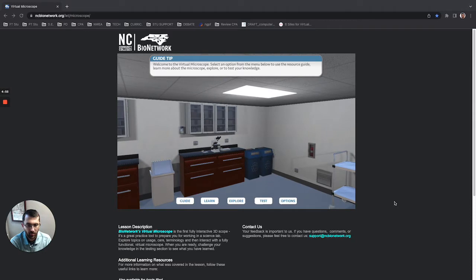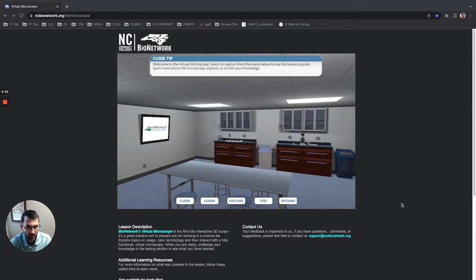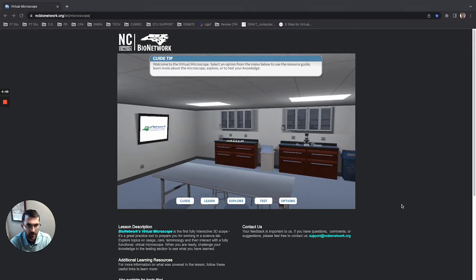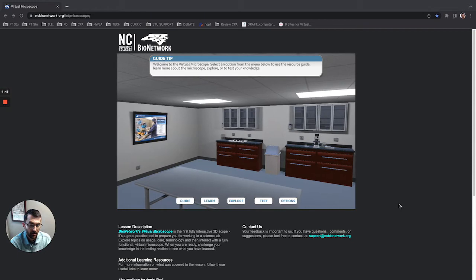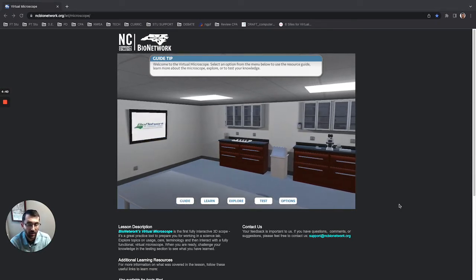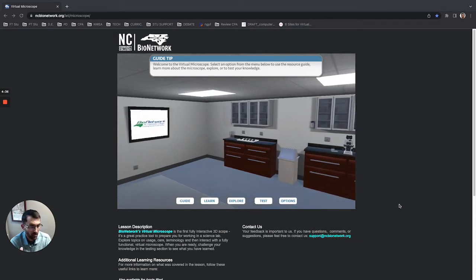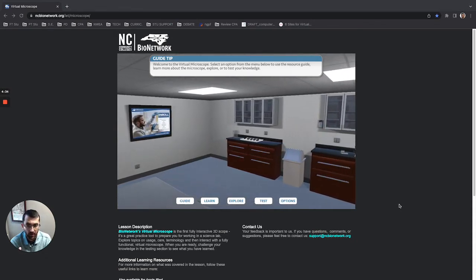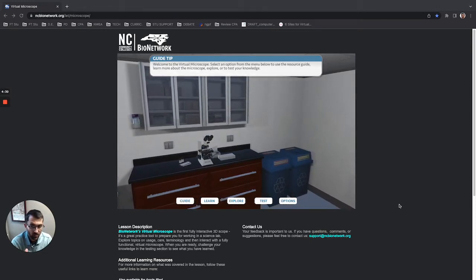I made this brief video to help you guys navigate the microscope and learn how to use it. The cool thing about this microscope lab, I'll tell you right off the bat, is that the functions operate exactly like a real microscope. And so you're getting a really valuable experience here by learning how to use a real microscope. So I'm going to show you basically how to use the microscope.